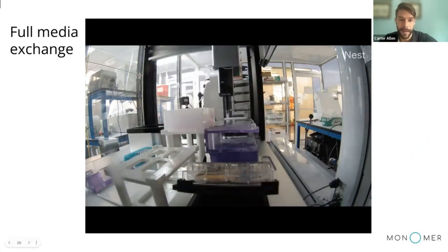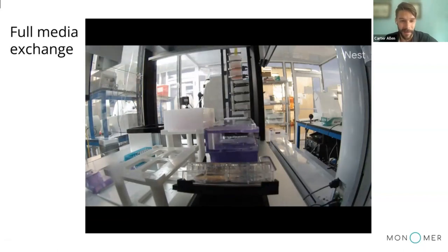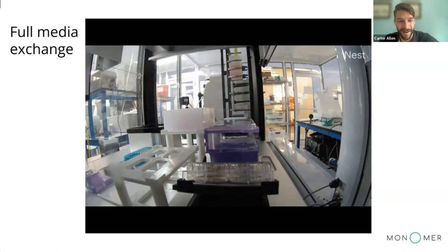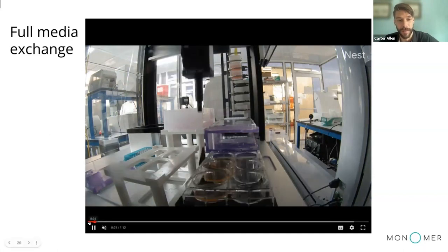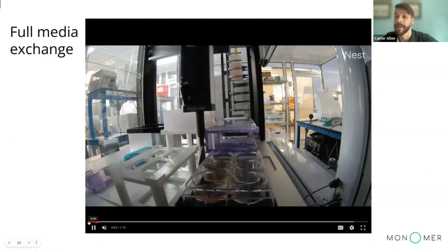And here you see the tilt module that we mentioned earlier in action, which allows you to fully aspirate the 2 mL of media that are in the well. Then we're grabbing media with the same tip and pipetting that in. And then we discard the tip afterwards and move on to the next well. We try to do one well at a time to minimize air exposure throughout that process, because that can lead to cell death if it's tilted and media free.